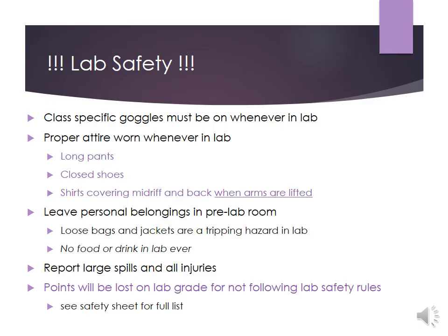Now we'll move on to some lab safety rules, though you will be expected to review and sign the full lab safety list during your check-in appointment. When in the lab, you must always wear the specified lab goggles, as well as proper lab attire. Long pants, closed shoes, and full coverage shirts are a must to protect yourself from chemical spills and broken glass. You may be asked to leave the lab if you are not dressed for safety.